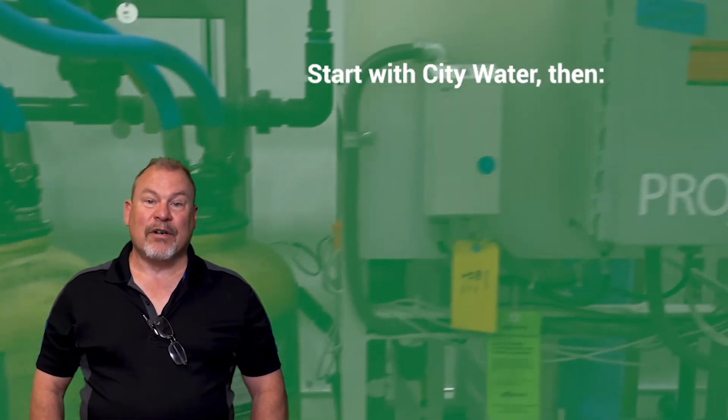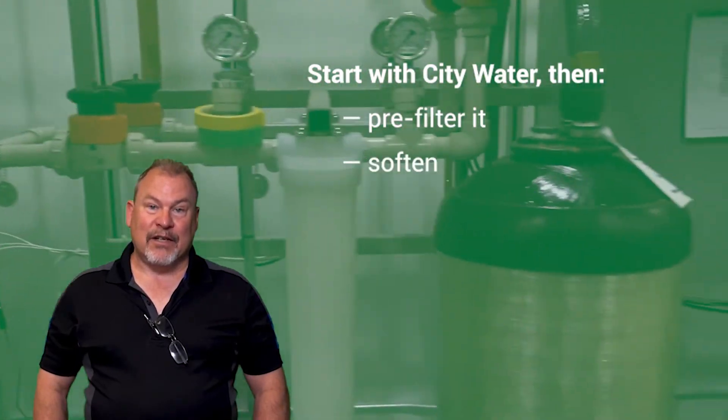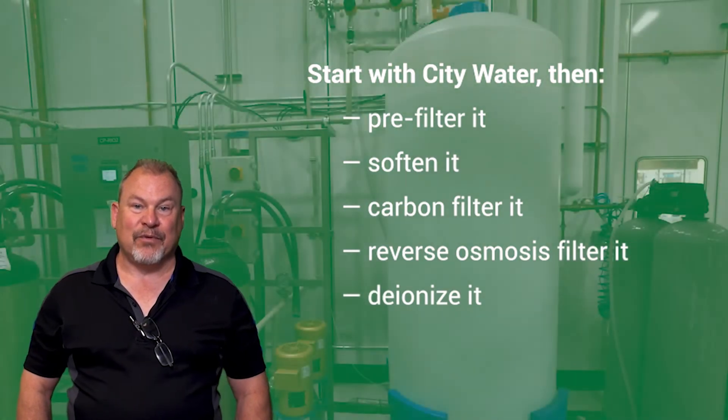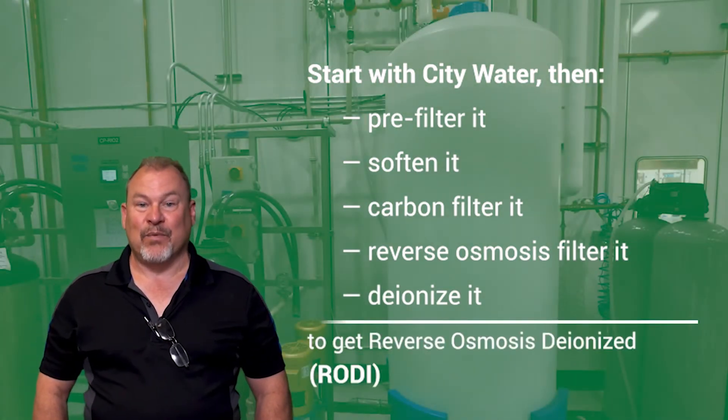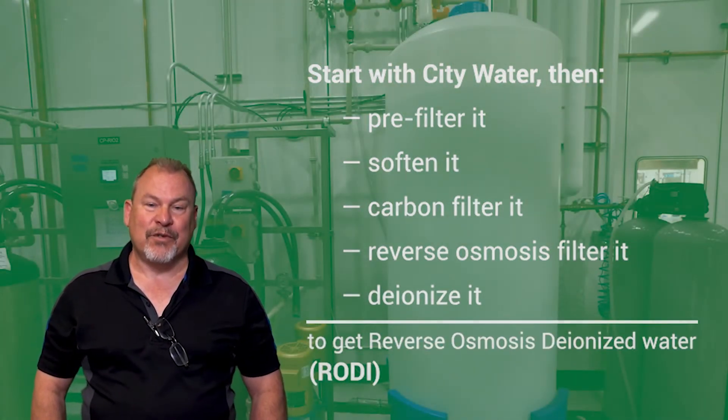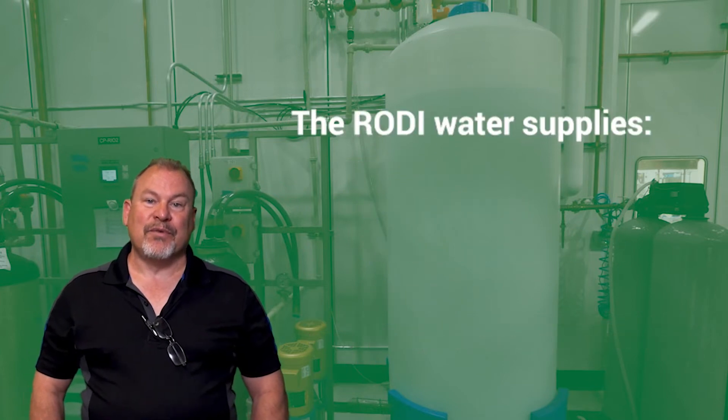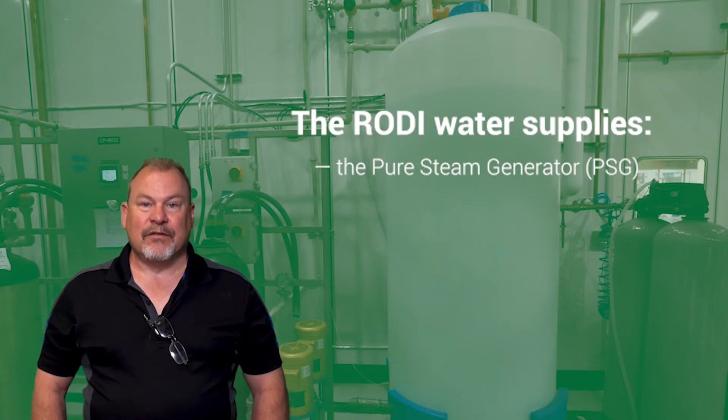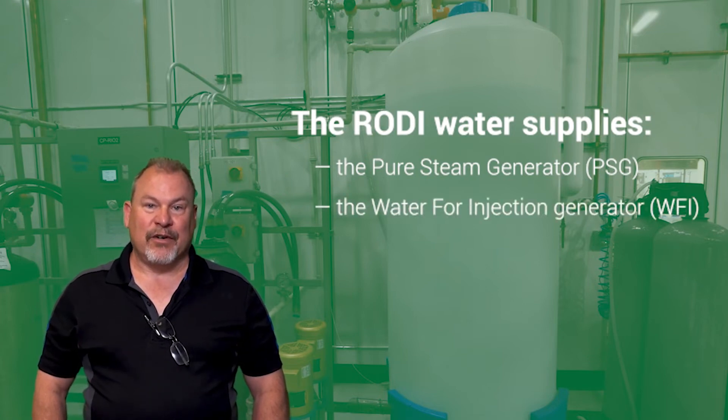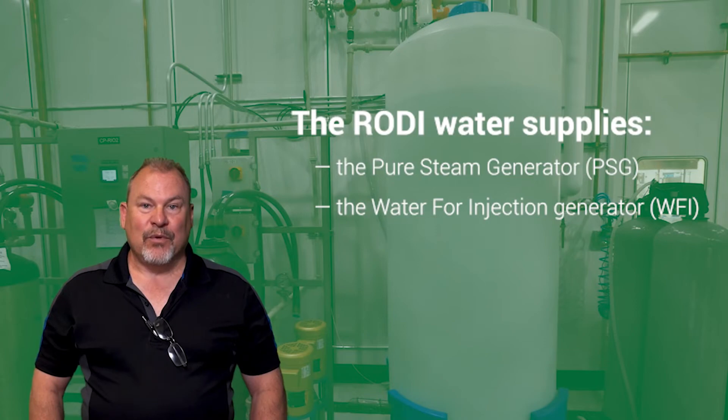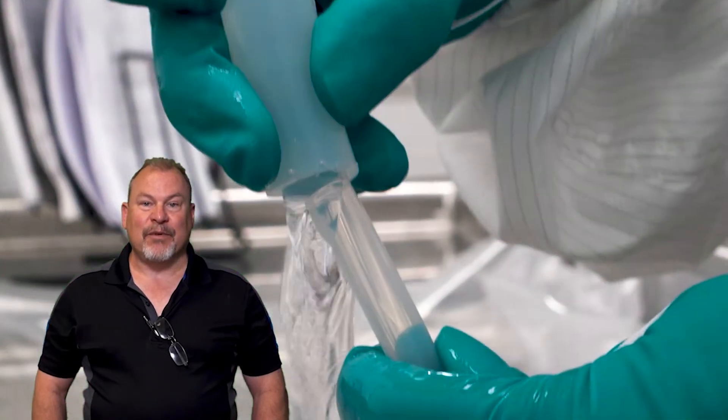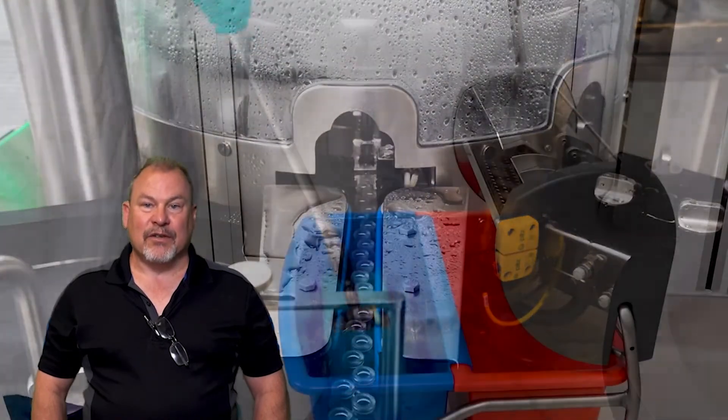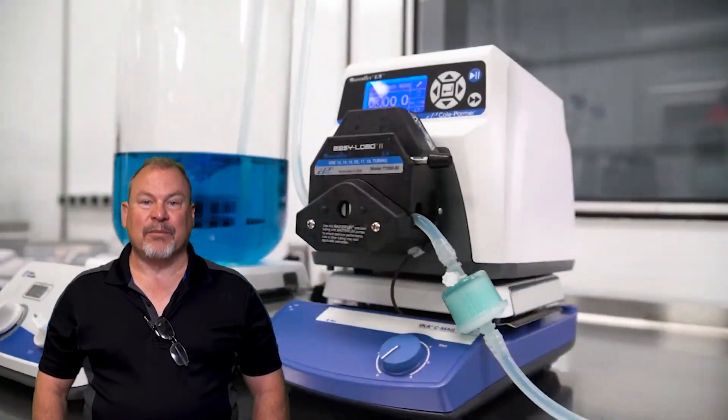We start with city water, pre-filter it, soften it, carbon filter it, reverse osmosis filter it, and then deionize it to manufacture reverse osmosis deionized water, or RODI water for short. The RODI water is used as a supply stock to the pure steam generator, or PSG, and for the water for injection generator, or WFI for short. We use RODI water, pure steam, and WFI to wash materials, run the autoclave cycles to sterilize equipment, to clean rooms, and to make injectable medicines. We do not want the water in the medicine we produce to make a patient ill.